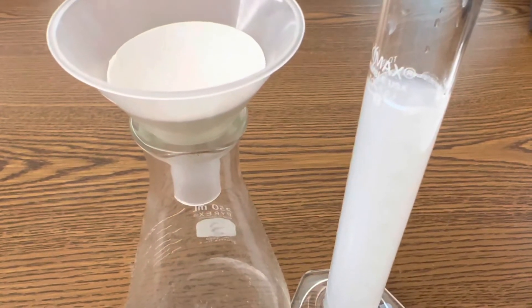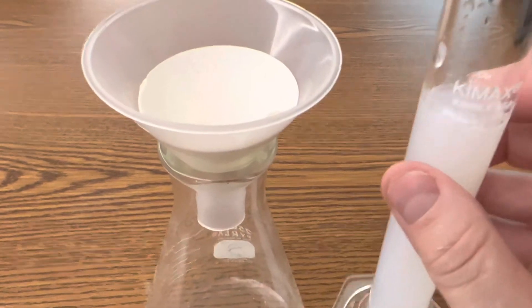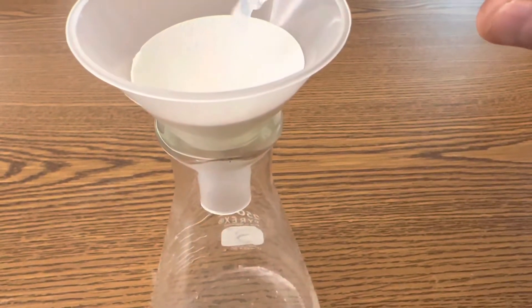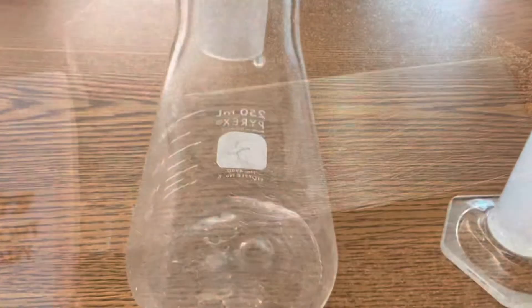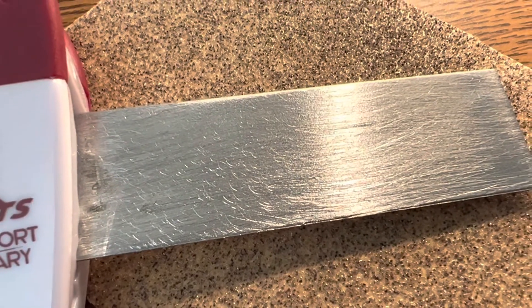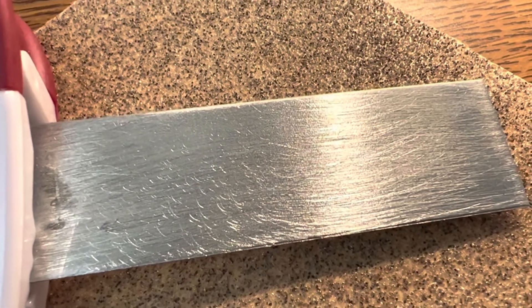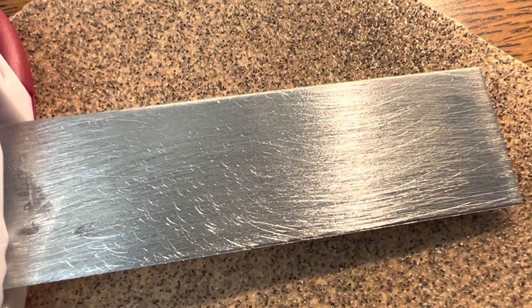Once you've dissolved your stannous chloride, go ahead and start pouring it through your filter to get rid of any particulates in the solution. This will take a while. The next step before you lower your zinc into your solution of stannous chloride is to sand off the oxide layers so that your zinc is exposed to the solution.